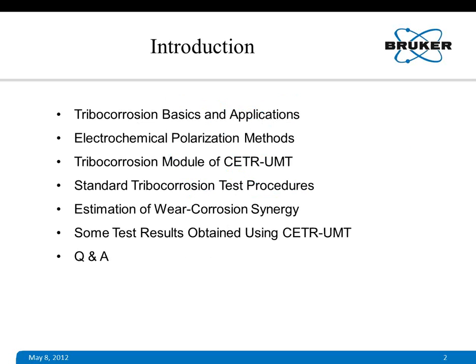In this webinar, I will cover some of the topics listed on this slide. Tribocorrosion basics and applications: some of the basics of tribocorrosion, what it is, how we work on tribocorrosion, and what are the things we get. And I will explain some of the applications. It has a myriad of applications. Next is electrochemical polarization methods. These are some of the techniques which are used for corrosion studies.